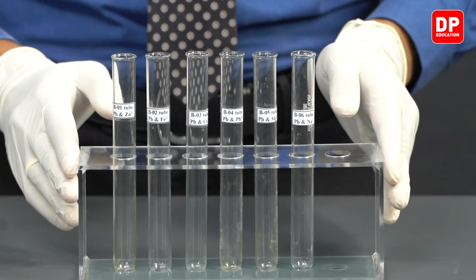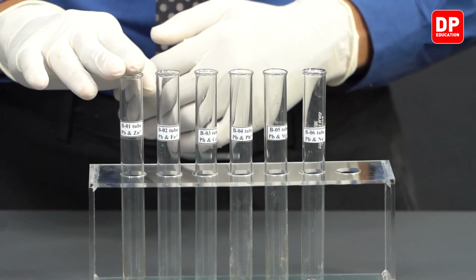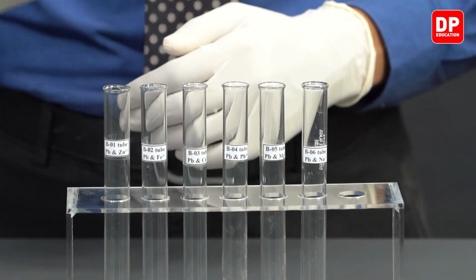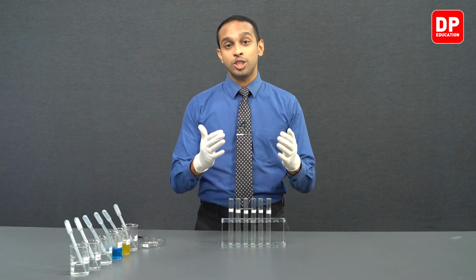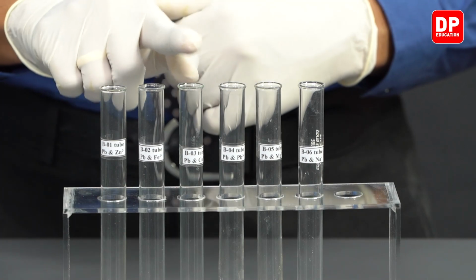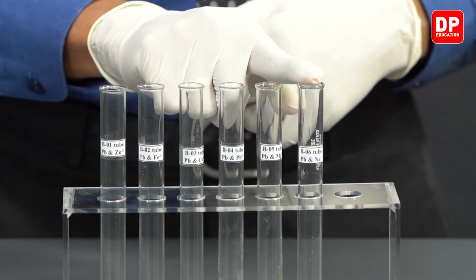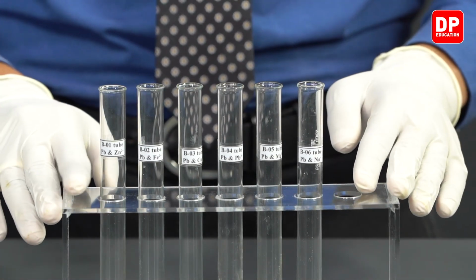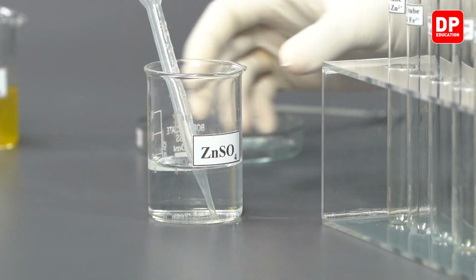Now these test tubes are labeled accordingly. So the test tube over here has the label Zn2+, indicating that we'll be taking zinc sulfate solution into this, because zinc sulfate solution will have zinc 2+ ions in it. And then we have Fe2+, Cu2+, Pb2+, Mg2+, and sodium 1+ or Na+. Into each of these test tubes, we will now take the relevant solution.